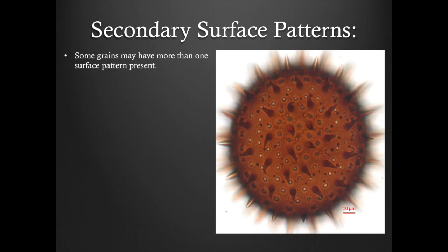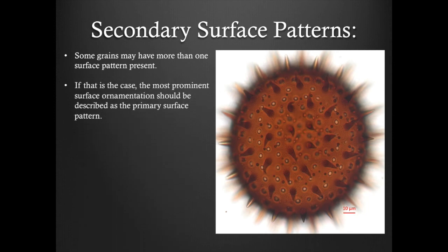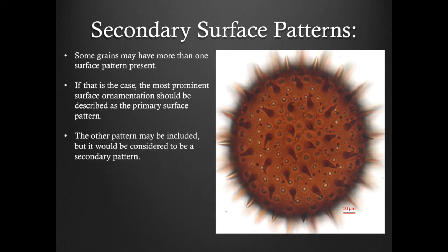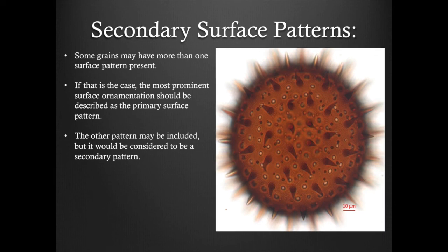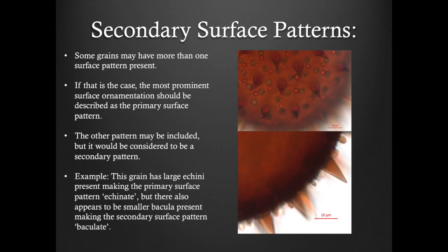Some grains may have more than one surface pattern present. If that is the case, the most prominent surface ornamentation should be described as the primary surface pattern. The other pattern may be included, but it would be considered to be a secondary pattern. Here is an example. This grain has large echinae present, making the primary surface pattern echinate. But there are also smaller bacula present, making the secondary pattern for this grain baculate.